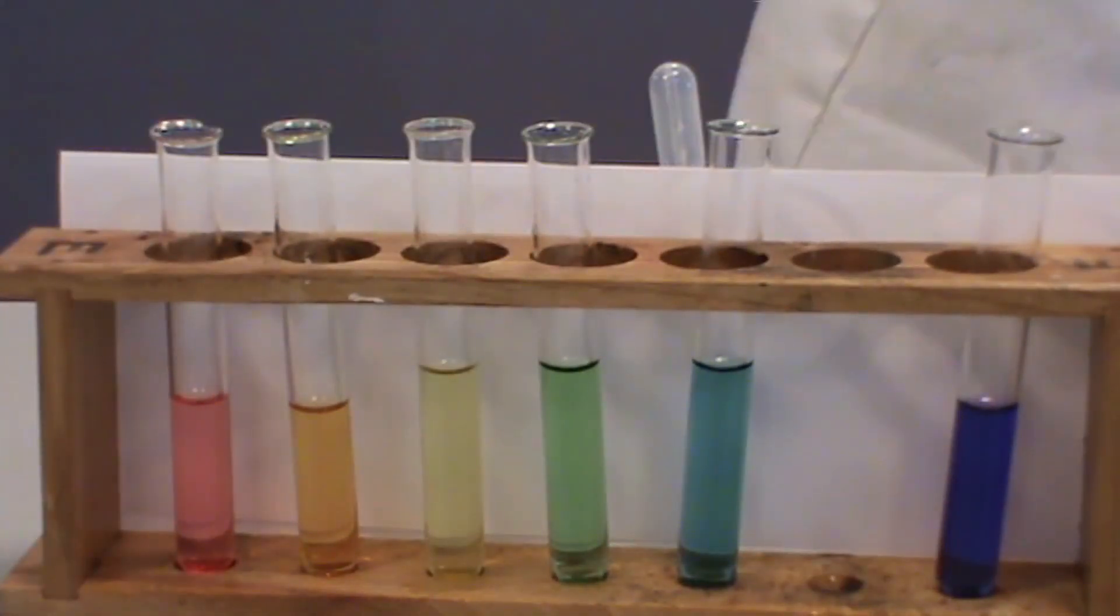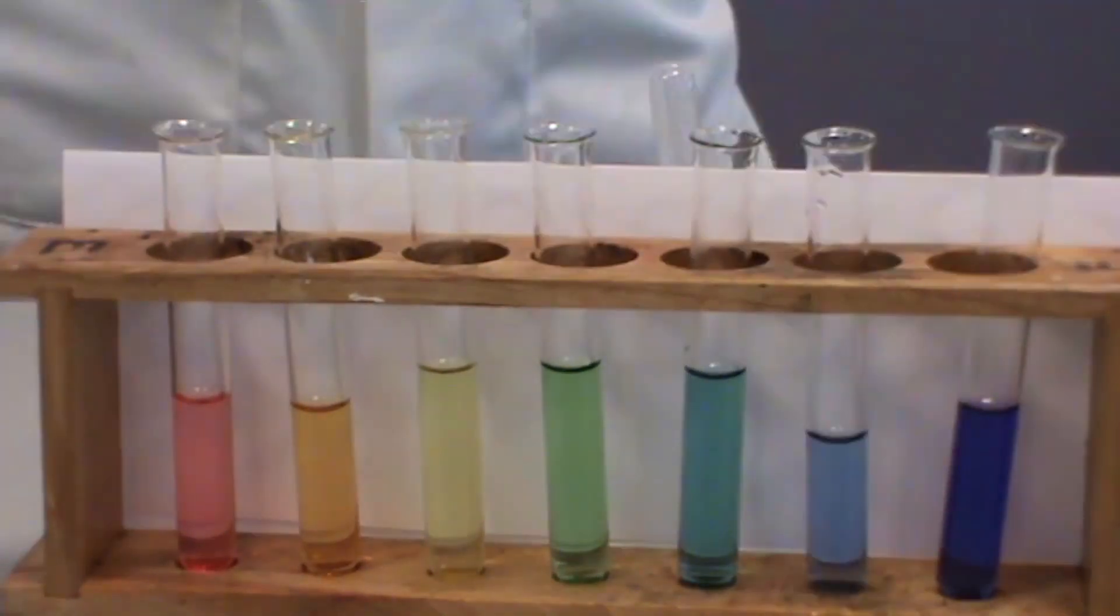At the end of the experiment, we can see that we now have seven test tubes showing a complete range of colours. These go from red, orange and yellow for acidic solutions, green for neutral solutions and blue-green, blue and purple for alkaline solutions.